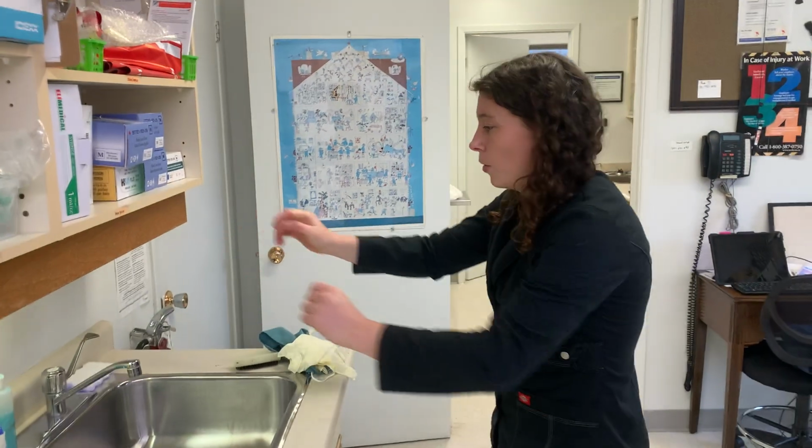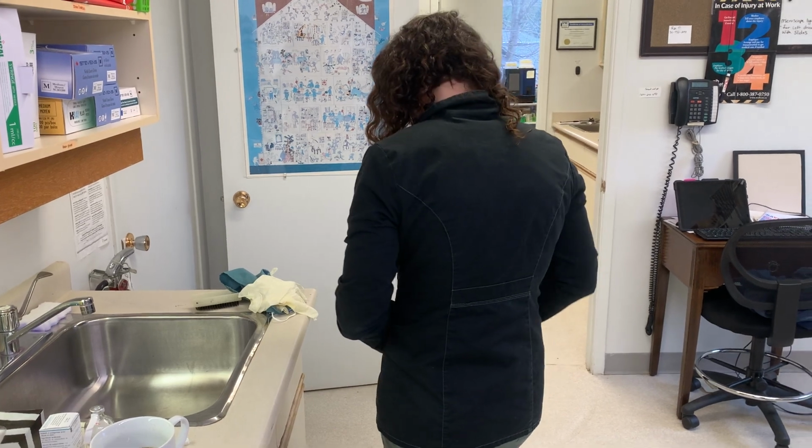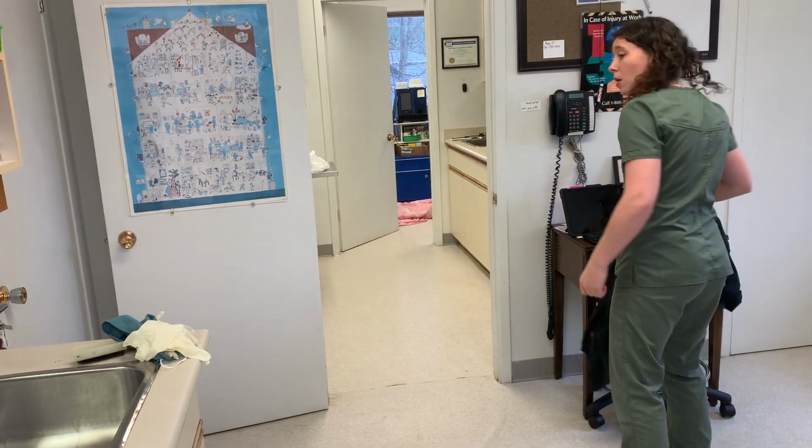Thank you. All right, Dr. Jones, thank you for that. So now what I need to do is remove my lab coat. So I'm going to remove my lab coat here. I'll hang it on the chair here to be washed.